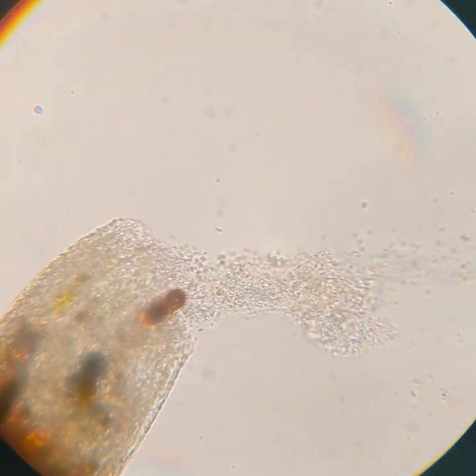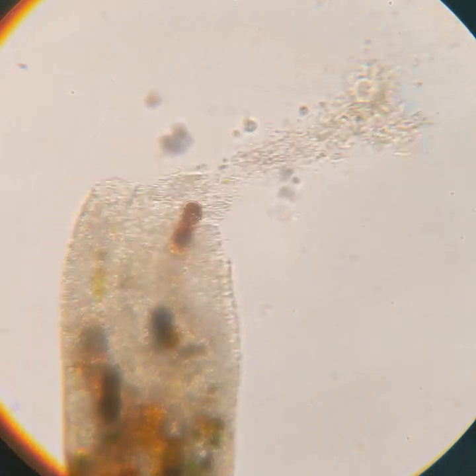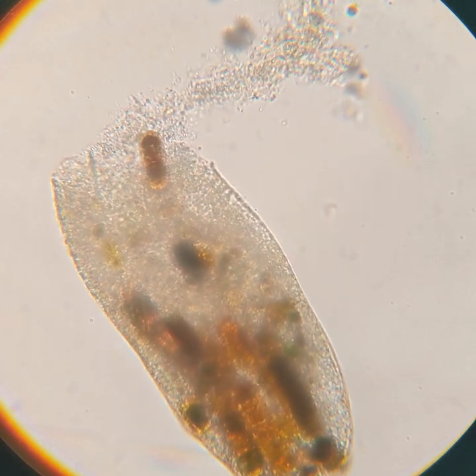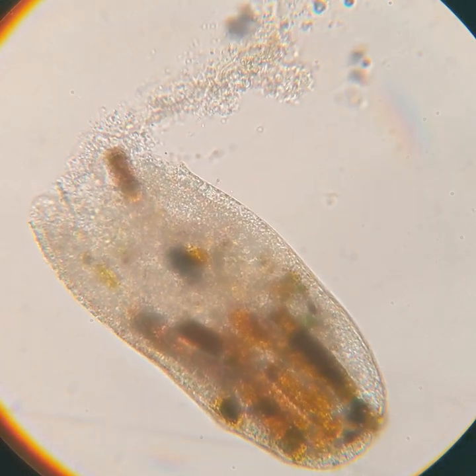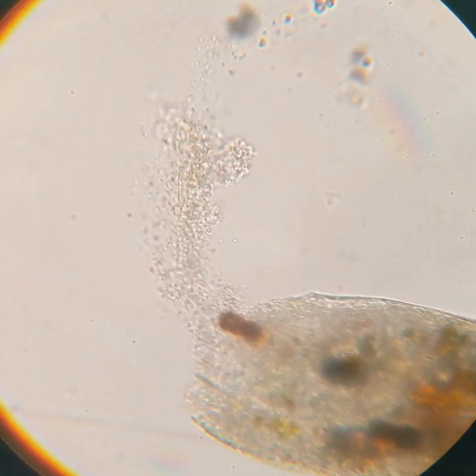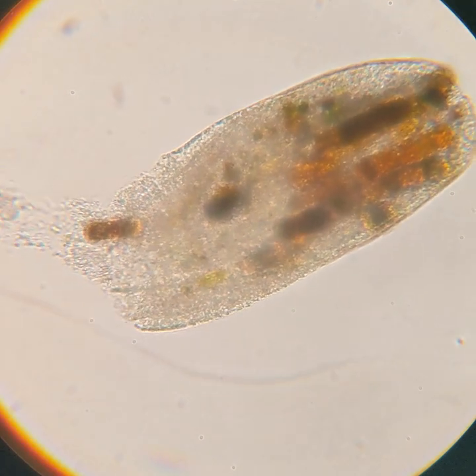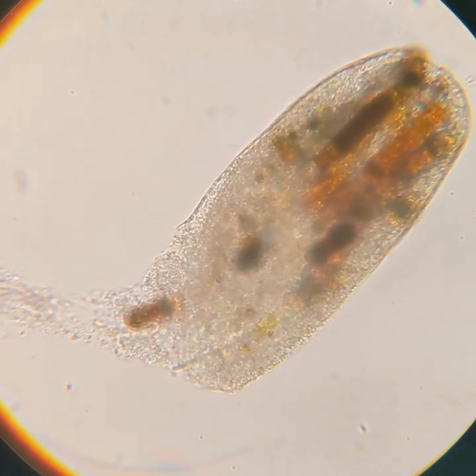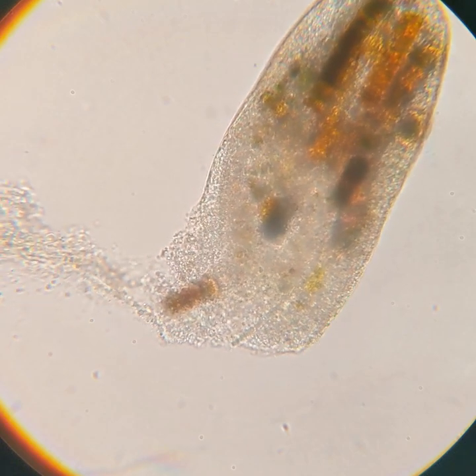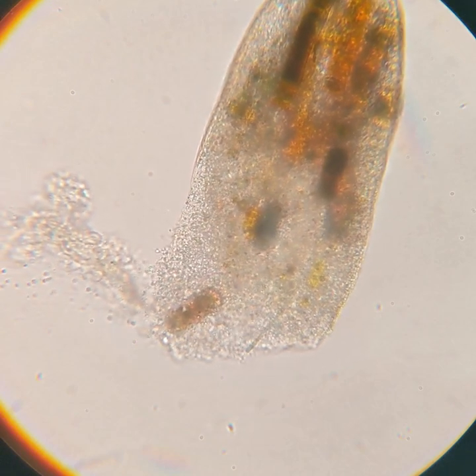Plus, we get to satisfy some of our morbid curiosity about what exactly happens when a microbe's membrane just starts to evaporate. By the way, you'll notice that this Frontonia actually spans almost the entire width of the viewable area here. I've measured that, and he spans a little over 300 microns, which is about one-third of a millimeter. So even though I call him that little guy, he's really not that small.